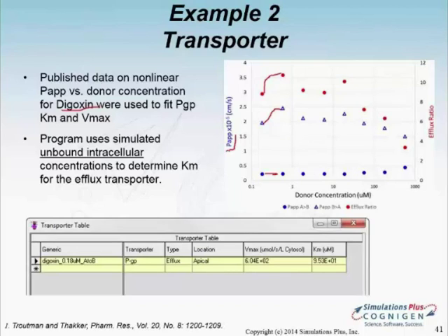Right now we did not have that kind of system information. It is at the moment more generic. Hopefully we'll get to that extension, so that for transporters which are pH sensitive we would make that adjustment, but it's not incorporated in this first version yet.